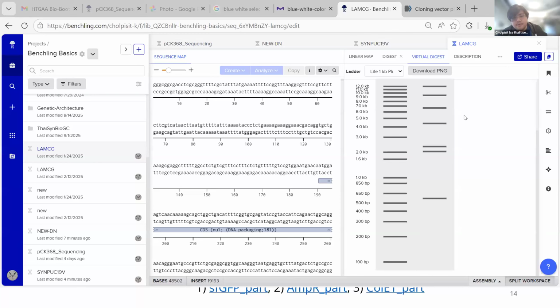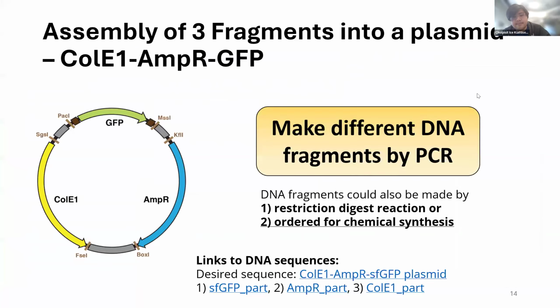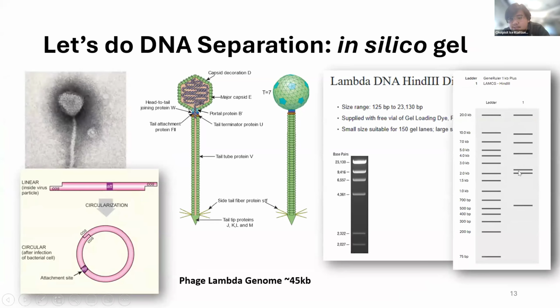So if we go back to the PowerPoint, it's going to match pretty much what you can see from this slide if you use the same enzyme. These are also the same as what was shown on the NEB site.